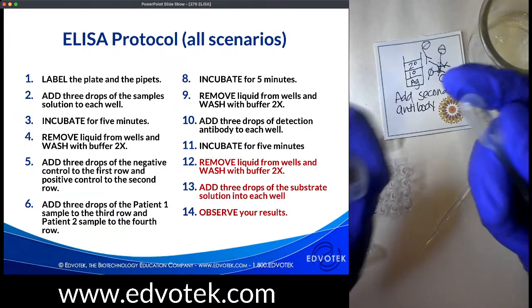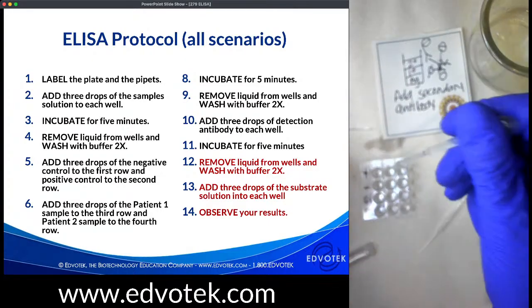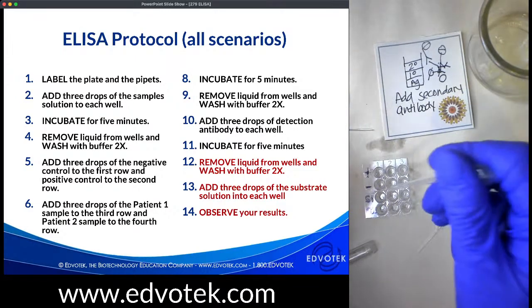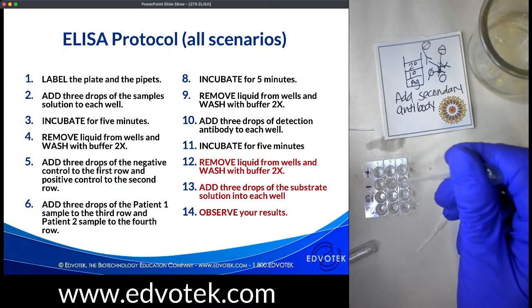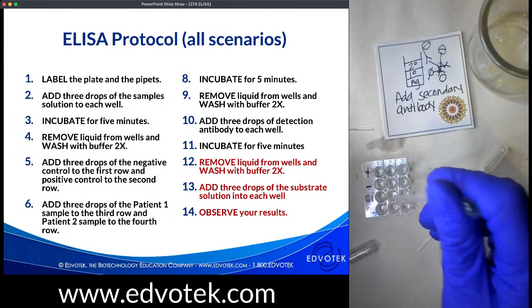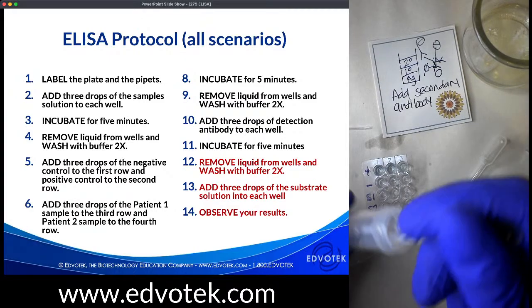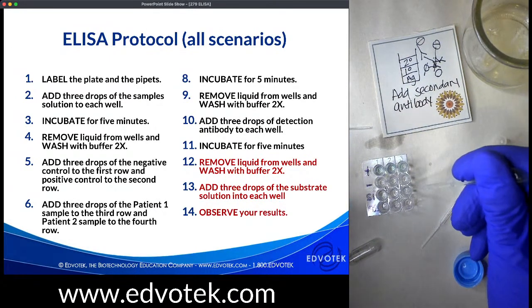So we're going to add our substrate now. This is going to be turned over by our secondary antibody, and in samples where it's positive, we should start to see a bright green color in the wells. It's going to take a couple of minutes to generate. I am putting too much substrate in here. Let me grab more substrate. I'm moving quickly, and I put a little too much in each of my wells, which is no big deal because I have a lot of it left. And I will just use this here.